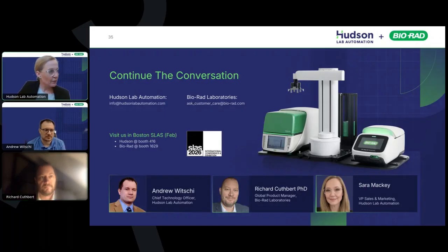Thank you, Richard. The next one is for Andrew. Where do most labs often struggle when starting automation? Is it choosing what to automate first, or really how far to go? Yeah, I think both of those are important. Really the big struggle for people is that big picture automation, right? And the reality is you can't do everything at once, right? So I think it is about deciding what to do first, really narrowing it down to what are those key bottlenecks. How do I solve those problems and provide immediate value, and then build that over time?